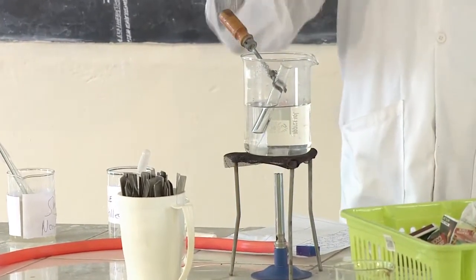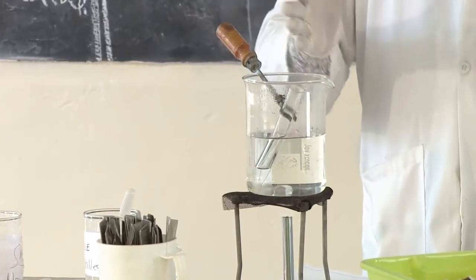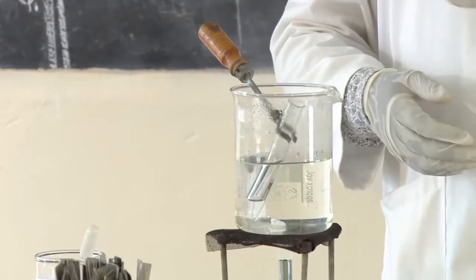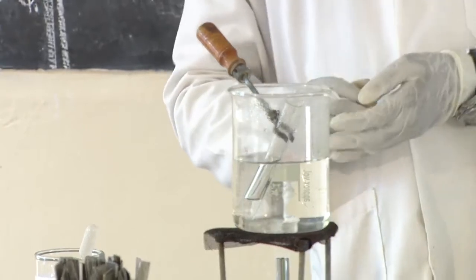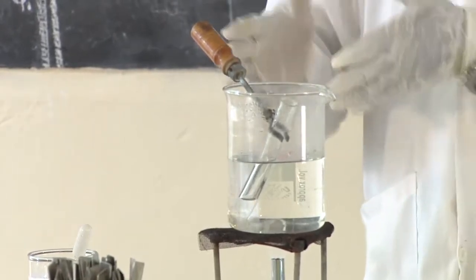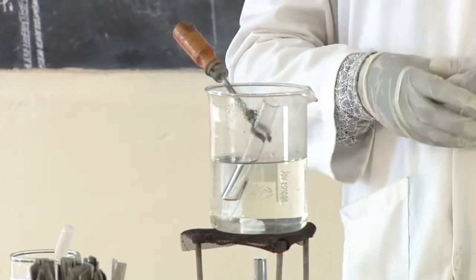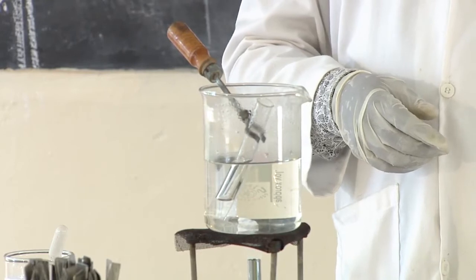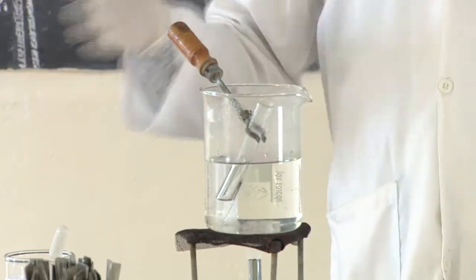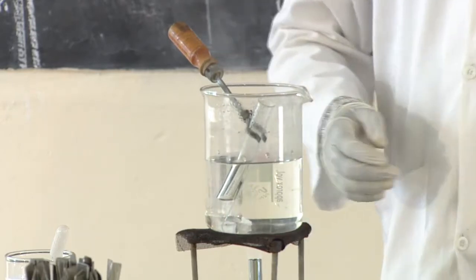We are not in a kitchen, we are in a laboratory. We are preparing the sucrose to test if the solution contains non-reducing sugars, with sucrose as an example. When you heat, after heating, you cool the solution. After cooling the solution, you add the Benedict solution. And then finally, you heat it again. So observe the process. I'm now heating sucrose. I have added hydrochloric acid.